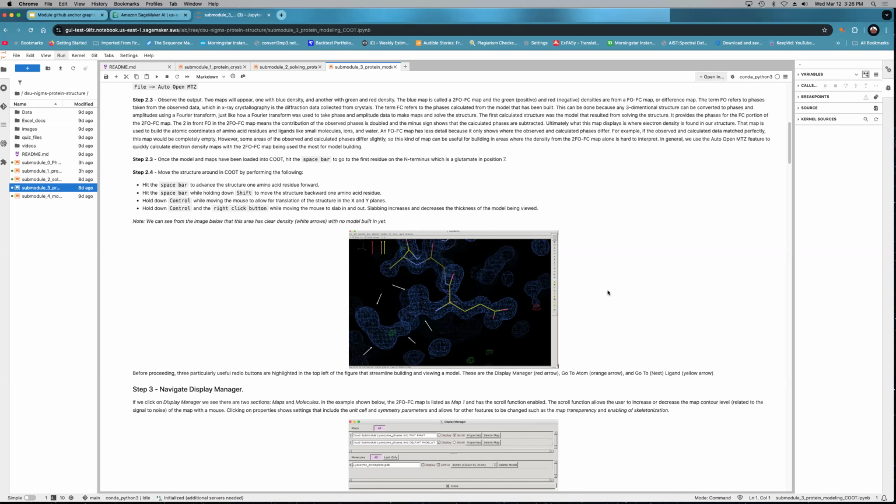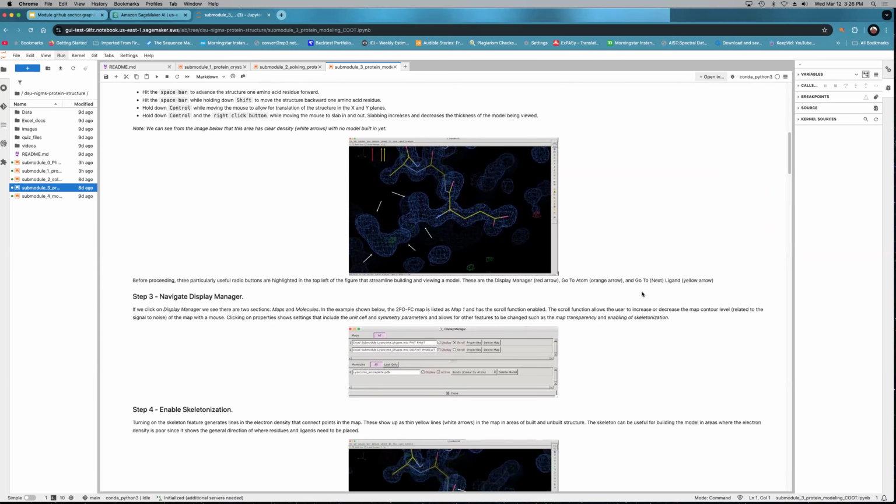And then once you've positioned it correctly, especially with the peptide bond with the oxygen atom and nitrogen positioned correctly in the density, you can add the side chain and then make adjustments as needed so the side chain is pointing in the proper direction. Sometimes it's hydrogen bonding to something else. And so you have to fit the density and have the proper hydrogen bonding donors and acceptors. So filling this in is relatively straightforward. This is really high resolution data, so that's kind of easy.